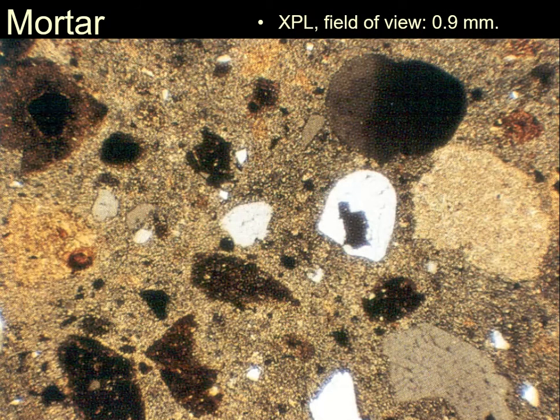And of course, there's all sorts of other materials other than pottery. Bricks, for instance, but also what keeps bricks together, mortar. And so here you can see the matrix here is lime, very similar to calcium carbonate. In fact, a lot of the calcium carbonate you may see has been turned to lime by the firing process.